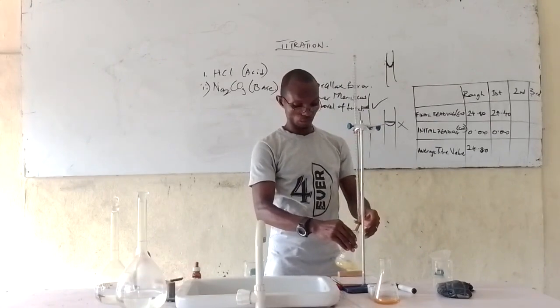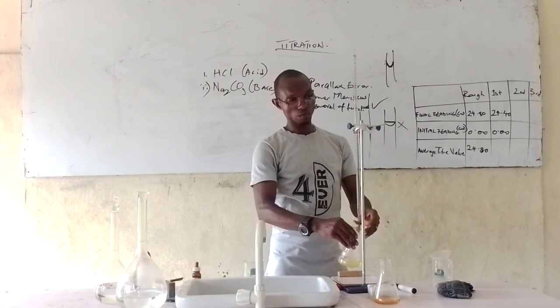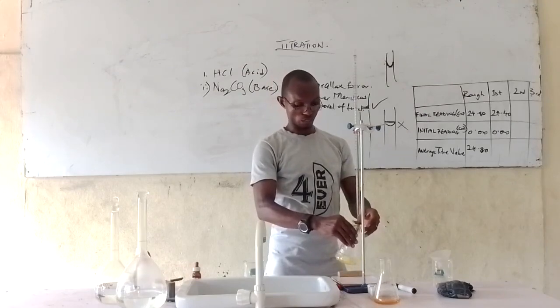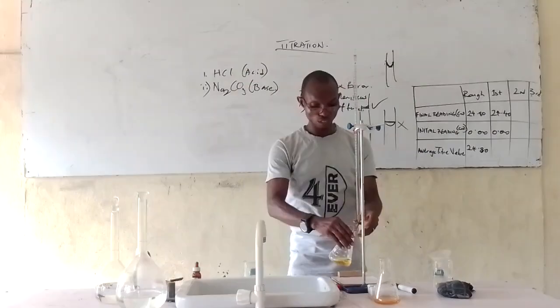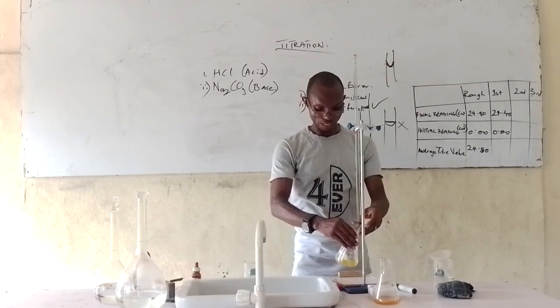I'm running my acid into it because I know the area that I'm actually going to. I am close by now, so I can start dropping my content in bits.